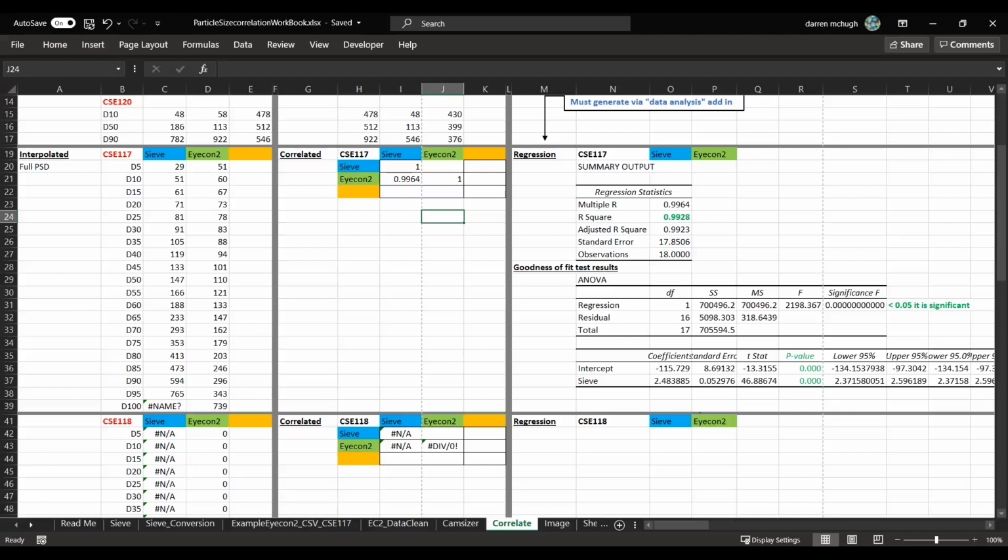Okay, we can actually see there's a relationship between the two of them. But does it matter? Is it statistically relevant? What's happening to trend? So correlation is great as the first step. It'll be part of your story toward your analysis. If you see a positive value like this, if you see something maybe negative, where the value was a minus, or if you've seen something that was probably below a 0.5, you would see a moderate relationship between the two values. It would be showing that there's issues, that these two sets of data have no relationship to each other. That could be for several reasons, but we won't get into that now.